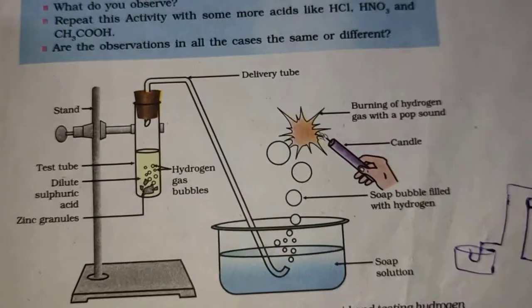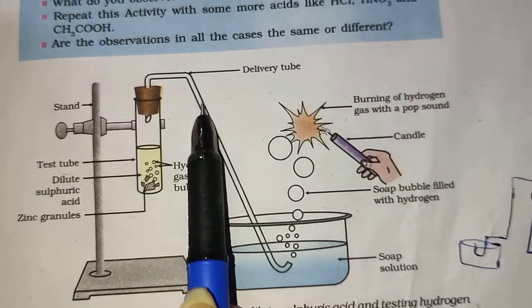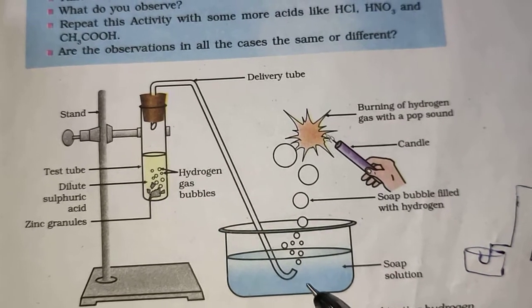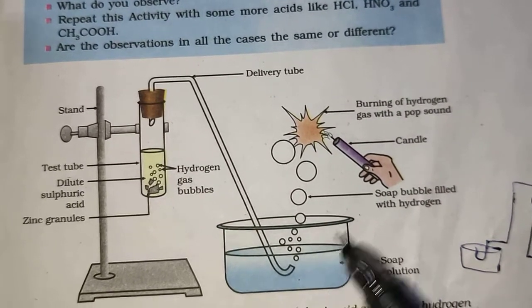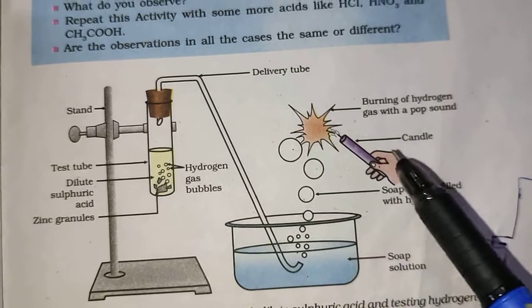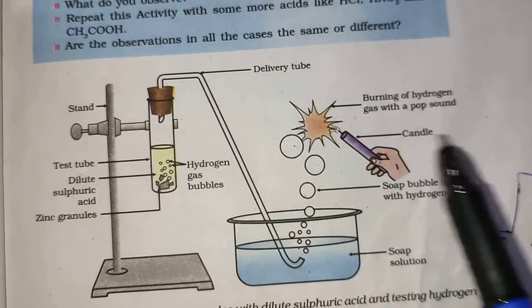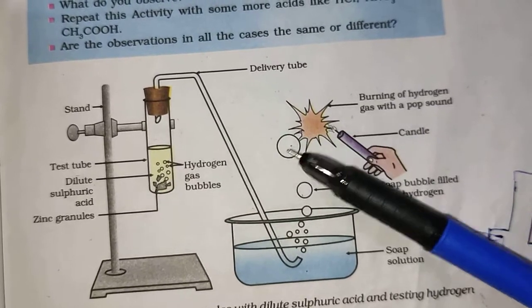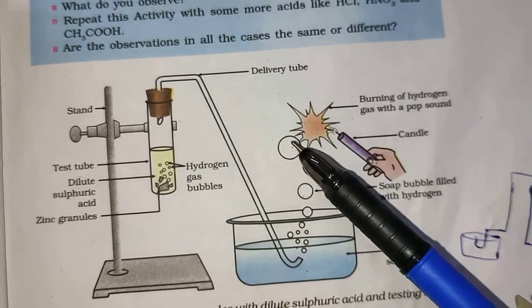So this hydrogen gas will go through this delivery pipe, and there is soap water. This is soap solution, and it will form some bubbles also. Within this bubble there is hydrogen gas. So whenever you keep a burning candle, then what will happen, it will form some pop sound.